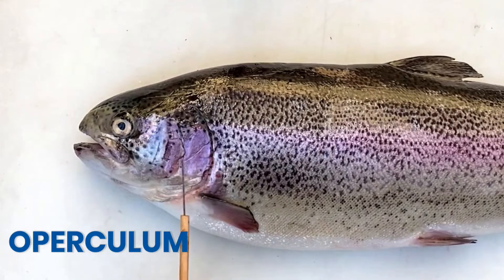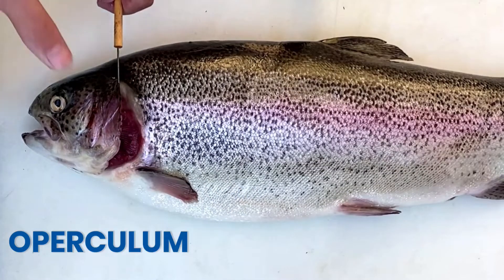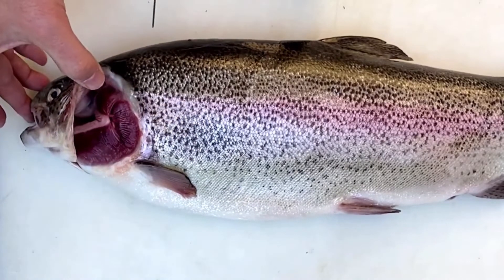Another characteristic of the bony fish is the operculum, a bony plate that protects the gills. It can be opened or closed to push water across the gills.